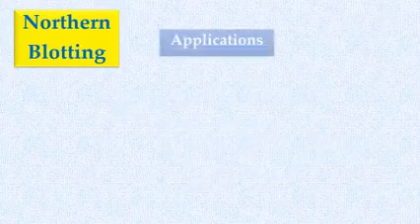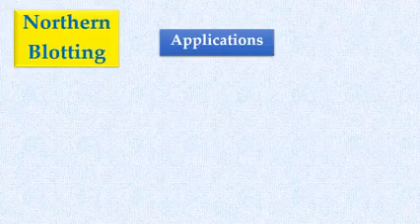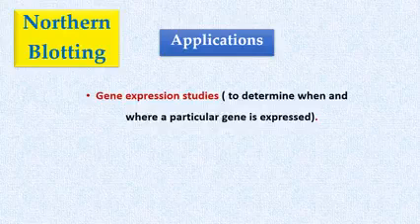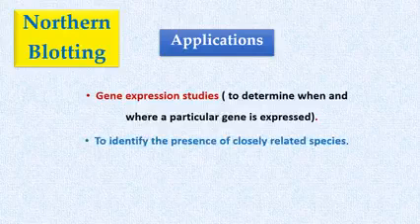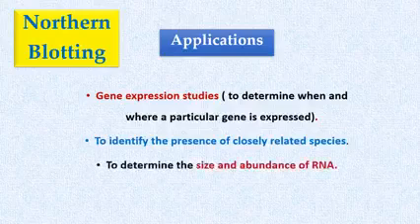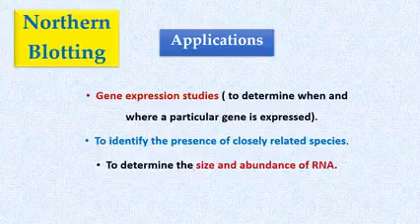The main applications of Northern blotting include gene expression studies, such as to determine when and where a particular gene is expressed, to identify the presence of closely related species, to determine the size and abundance of RNA, and for the analysis of RNA processing.